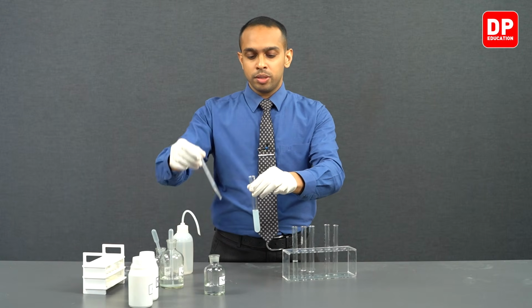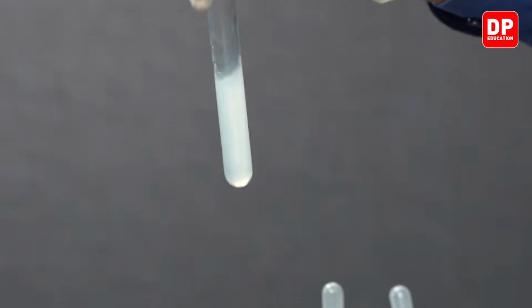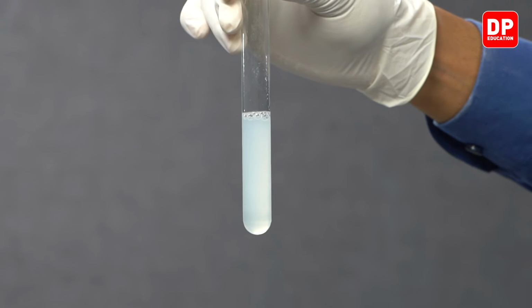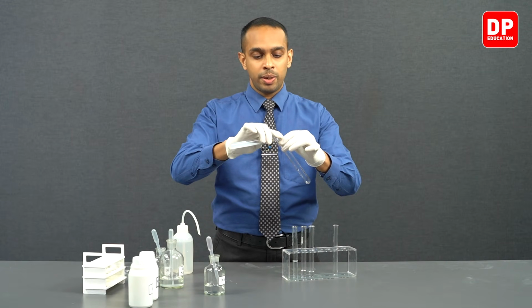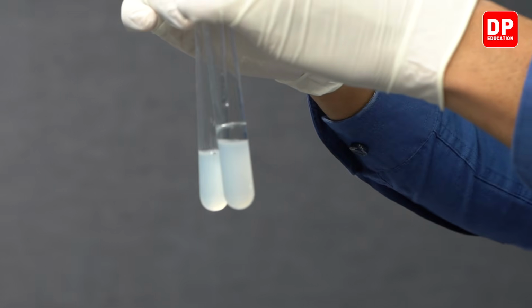We can add a few more drops of sodium hydroxide. You can see magnesium hydroxide is formed. Magnesium hydroxide is a white color, water insoluble precipitate. And this magnesium hydroxide suspension is going to be separated into two different test tubes.